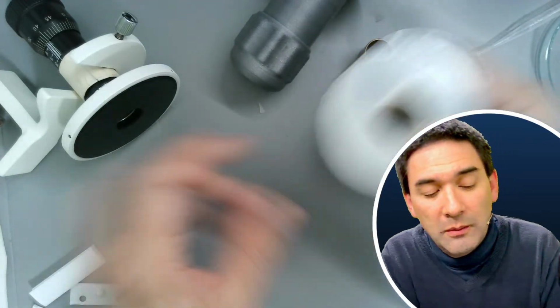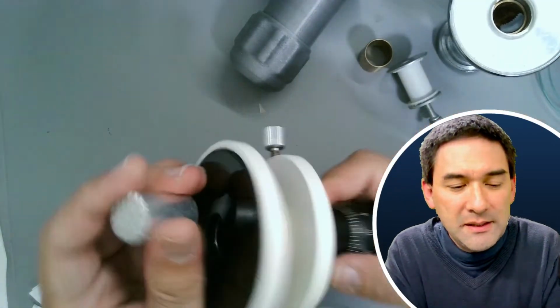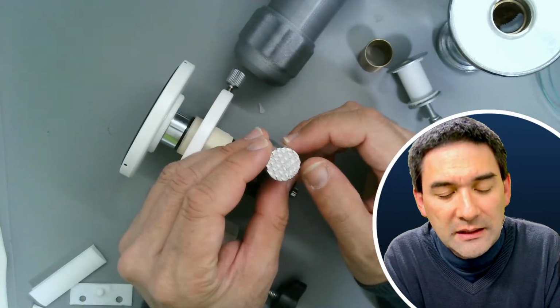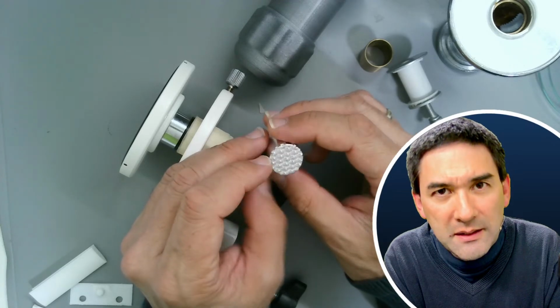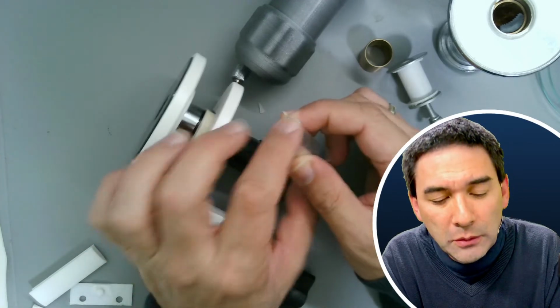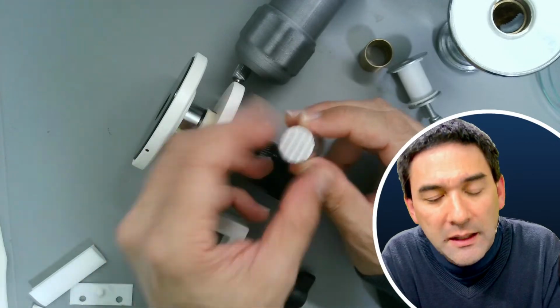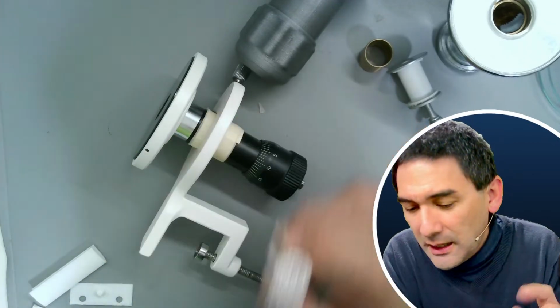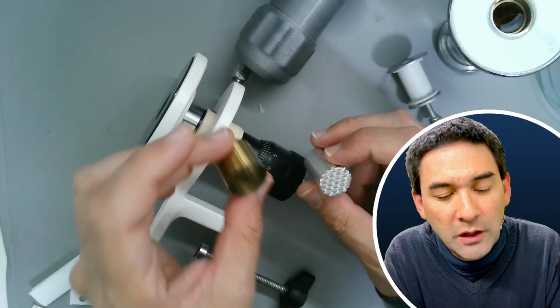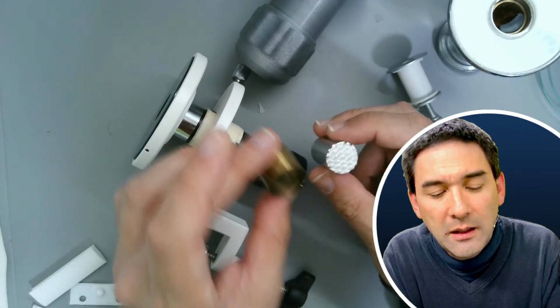So if it doesn't have a clamp, how does this even work? There is this little piston in here, and I think the way that it is intended is as follows: that you can make specifically animal tissues that are embedded in paraffin or wax, and it can be melted to the piston. So it actually is stable if you're embedding the specimen in paraffin. And it even came with a little cylinder here, and I don't know what this was for, but I can imagine that this is the mold for making paraffin.